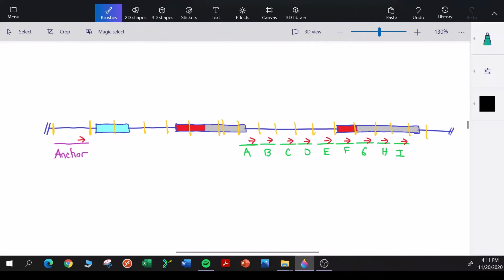So androgen receptor can bind to DHT and then go into the nucleus and bind to the enhancer and help rearrange the chromatin in a way that allows for transcription of KLK2. And then they're going to have some cells that they don't treat with DHT, and those are going to be the control cells.